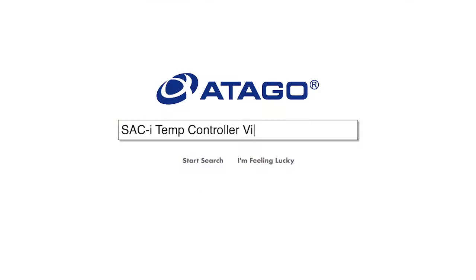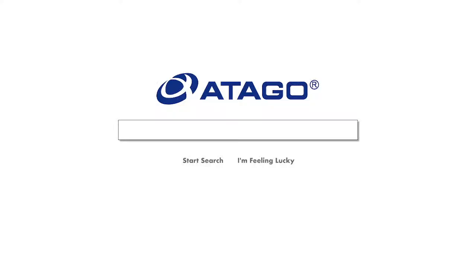So this one that we're going to see is the SAC-i temperature control. We're going to see it in the SAC-i environment. It will work very similarly in the AP300, and will also work very similarly with the Polax, if you have one. The Polax, for those of you who don't recognize it, is the analog polarimeter. So it does fit on both our digital models and the analog version. But the video we're going to see is only related to the SAC-i.